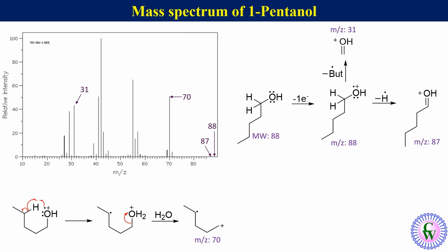This radical cation removes methyl radical to produce cyclobutyl carbocation with M/Z value of 55 that corresponds to M-18 minus radical peak. The same radical cation eliminates ethylene like this to produce propylene radical cation with M/Z value of 42 that corresponds to M-18 minus alkene peak.